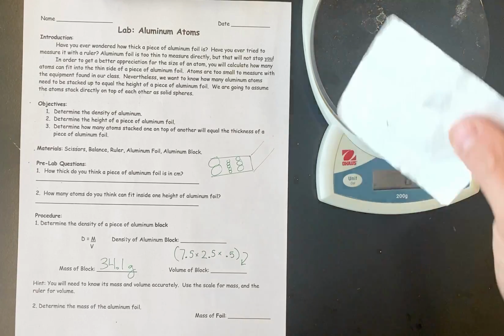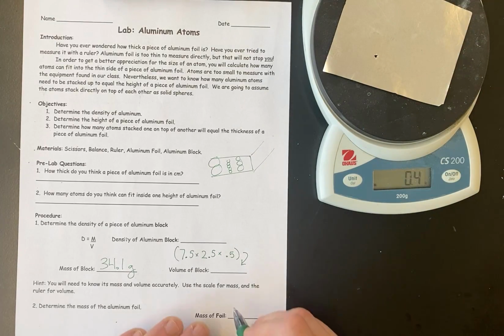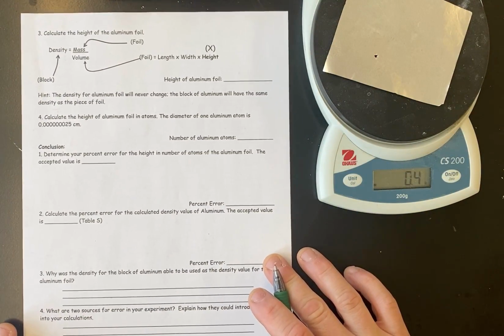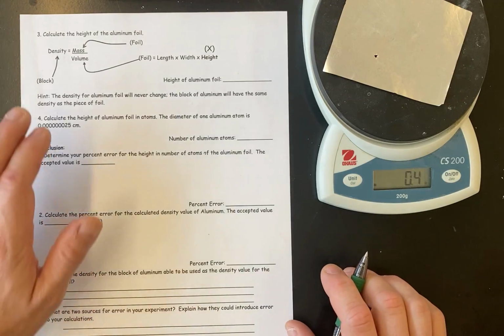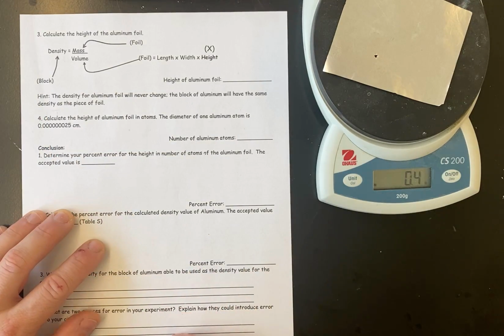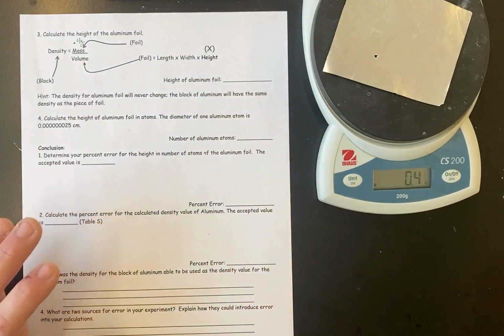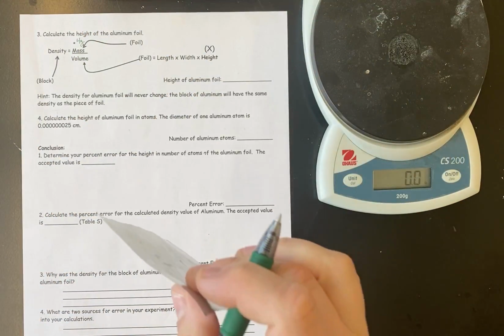The next thing we have to do is weigh the foil. So we put the foil on the scale, 0.4 grams. Next, here's where we get a little fancy. So we are going to use the density of the block that you just calculated. Then we are going to use the mass of the foil, 0.4 grams. Now we're going to figure out the volume of the foil.